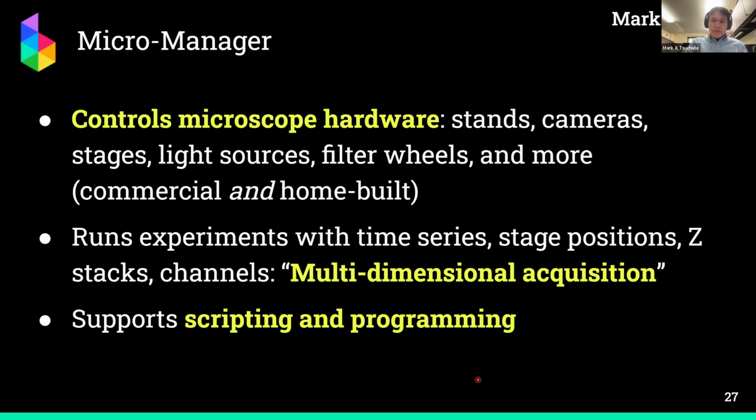And the main thing that we do is it runs experiments, of course, by automating time series acquisitions, multi-stage position, or in some cases, multi-well plate imaging, Z-stacks, and multi-channel imaging. And also, Micro-Manager supports scripting and programming. And so people have built plugins for Micro-Manager to do special things based on that. And also we have a Python scripting interface whose development is led by Talley Lambert, whose name seems to come up a lot today.